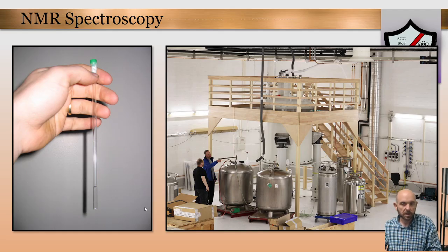And then I really like to include this picture. This is a picture of one of the more advanced NMR spectrometers in the world right now, and you can see the size of it. So this tiny little sample tube in relation to this giant looking instrument slides down. You have to climb the steps that you see here and put the tube in the top of the instrument, and then the tube slides down into the instrument and is analyzed using this technique.